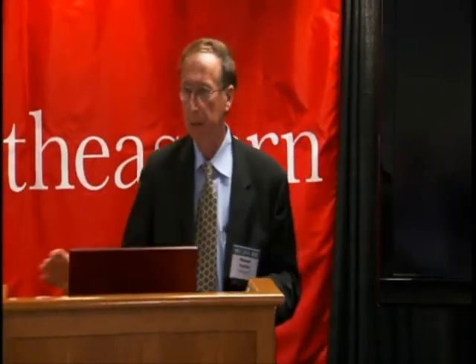And the last hurdle, which is often overlooked even at this stage, but shouldn't be, is the regulatory path. It's easy to think that you've got the best assay. It's incredibly difficult to take that assay and convince a regulator who is not going to accept any risk that it works. And it gets even more complicated when we talk about multiplexing.